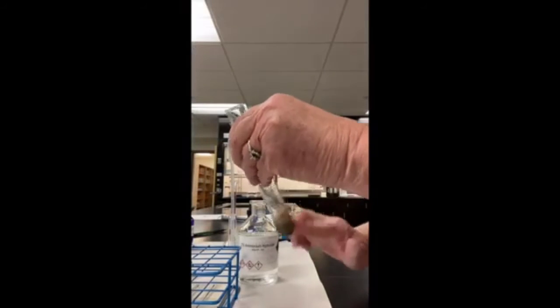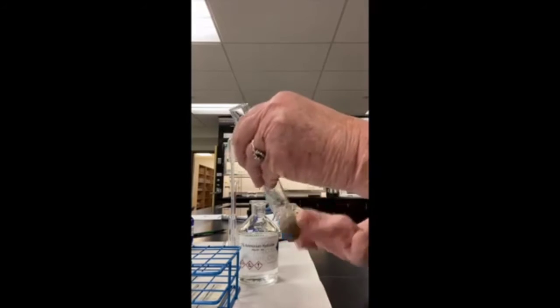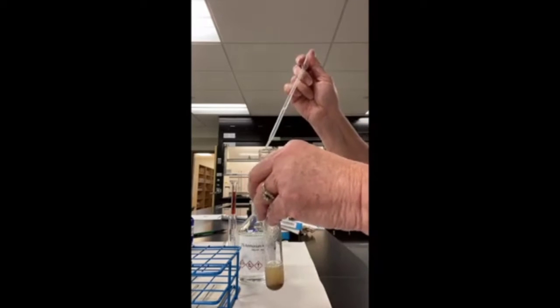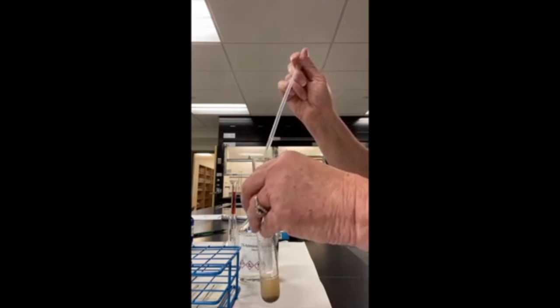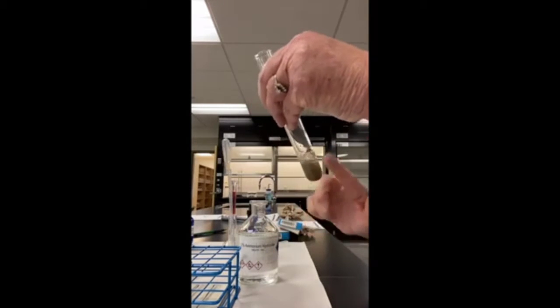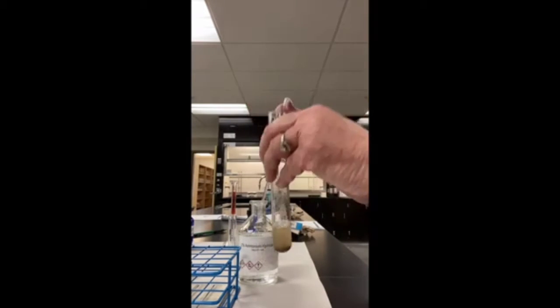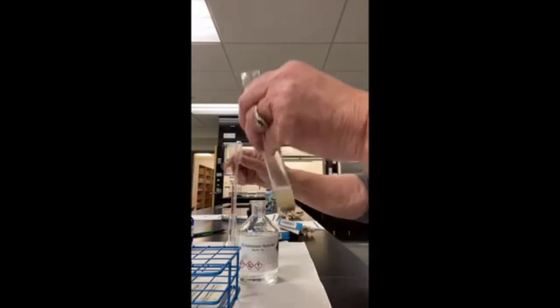We have a dark precipitate going on in here. And then the directions say add just enough ammonium hydroxide till the precipitate goes away. So I'm going to add a couple of drops. Let's mix that, see if it goes away. Not yet. Put in a couple more drops. About 5 drops there, I'd say.